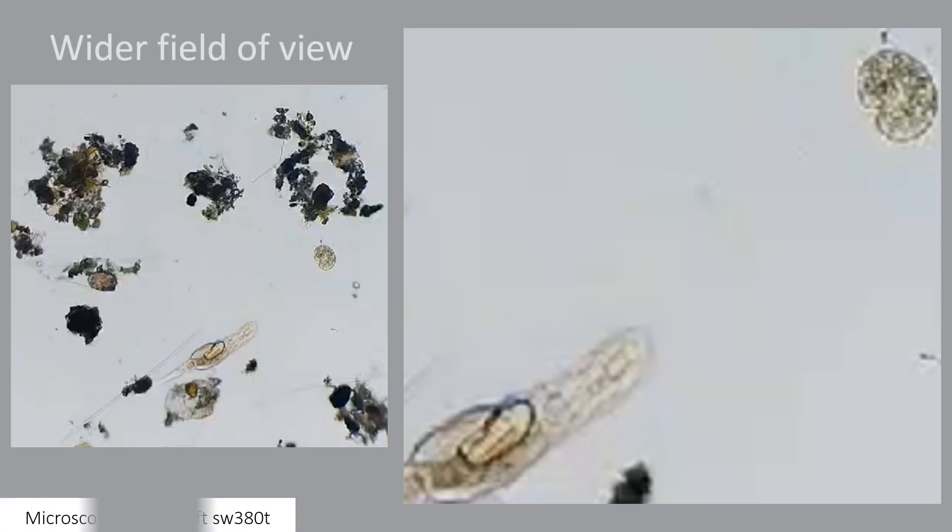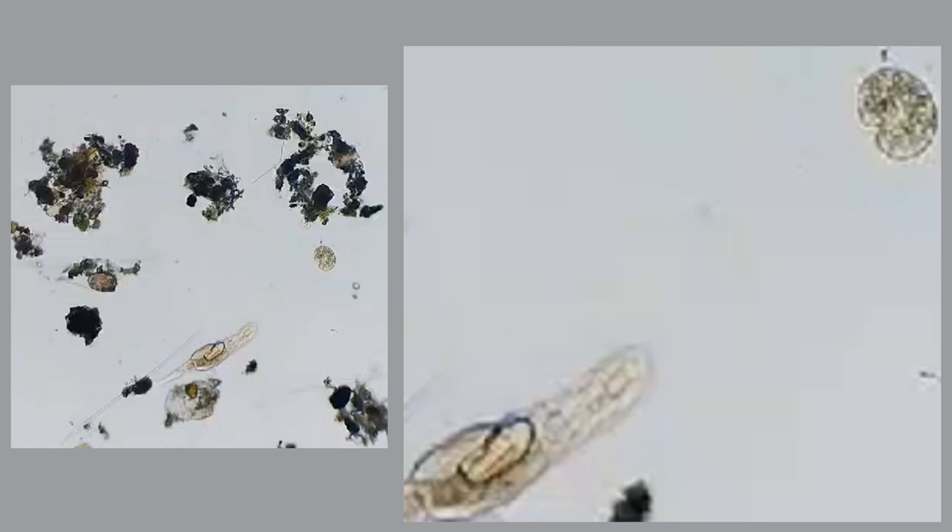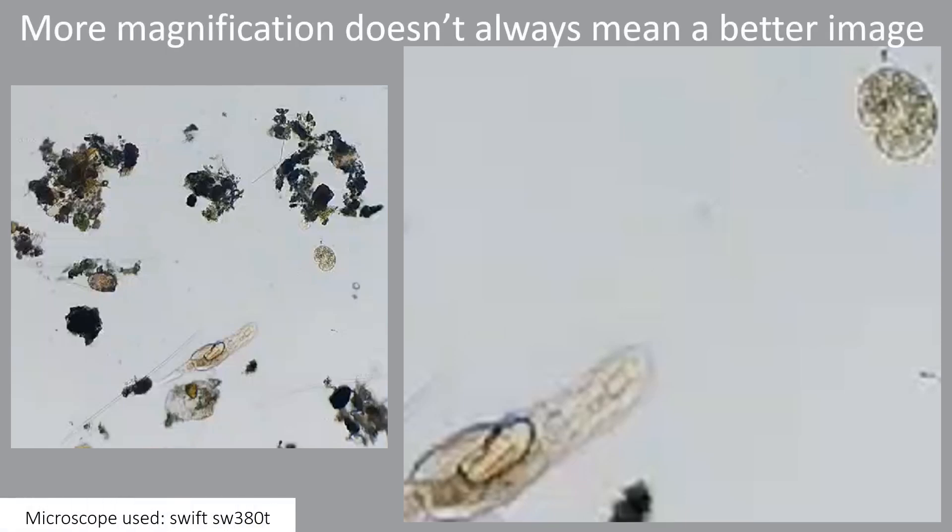The image on the left has a wider field of view, which means more of the sample can be seen at once. So, more magnification doesn't always mean a better image.